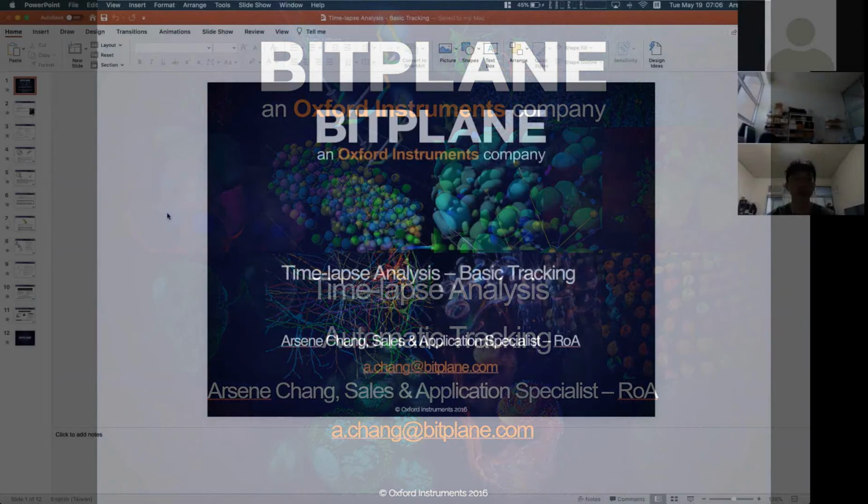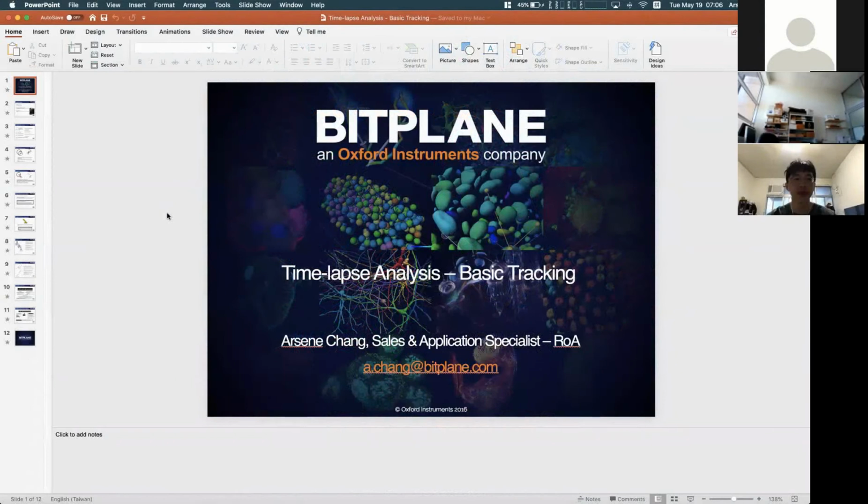Okay, so today we are going to talk about the time-lapse analysis in Imaris. We will start from the basic tracking today, and for next sections, we will move to more advanced parts.